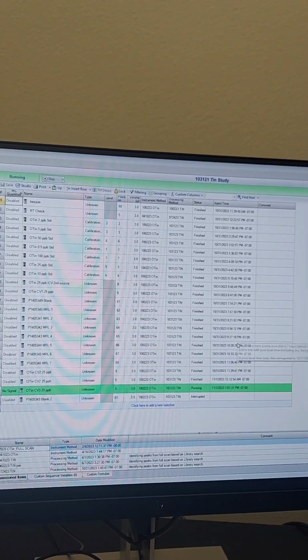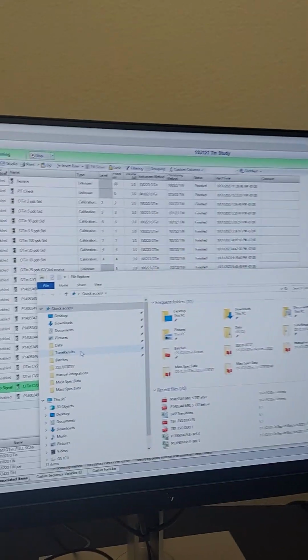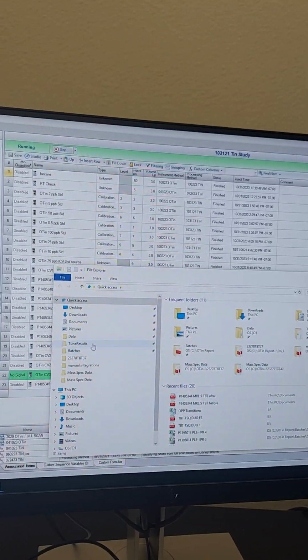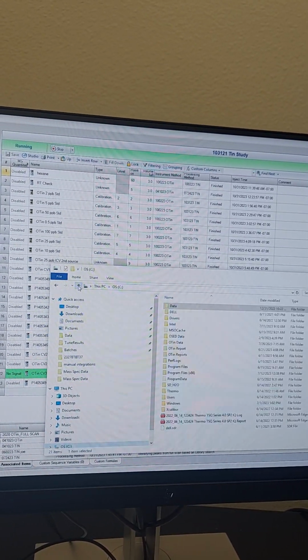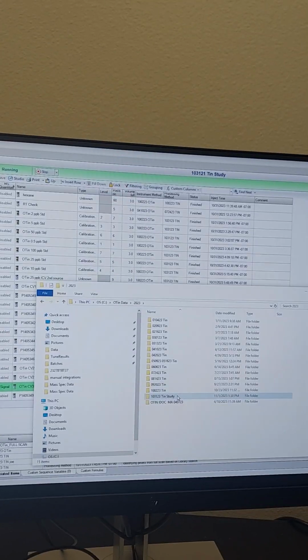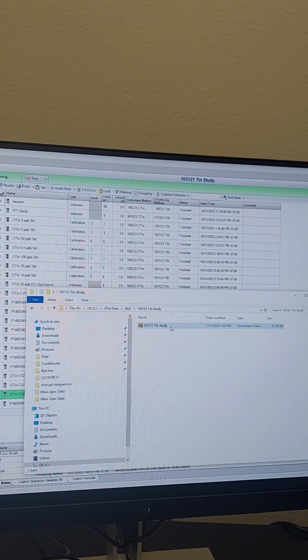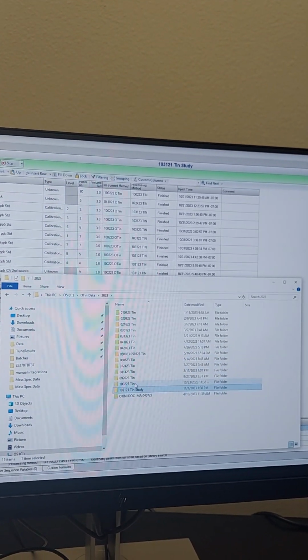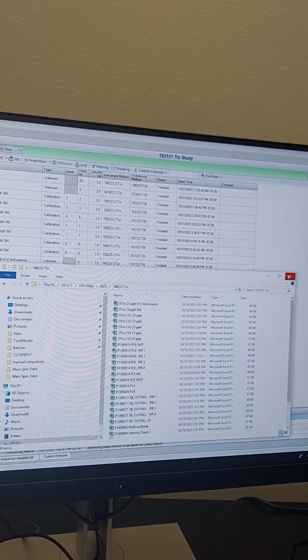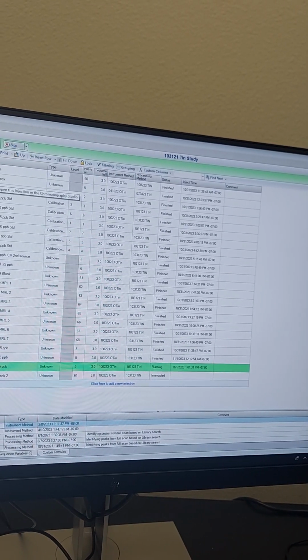Okay. Then, let's go take a look. What's the data? 23. This one. Oh my gosh. Let's see how they did it. Okay, so Excel. They did do Excel, okay, good. But why did it not work? Okay, let's try this again.